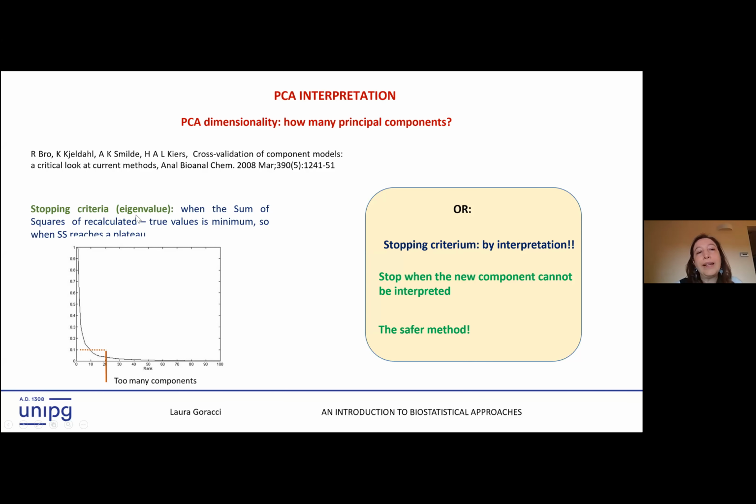Here is the stopping criteria by eigenvalue, which I'm not covering today due to the time, but the best criteria, especially if you're not an expert, would be stopping by interpretation. When you are not able to interpret your data anymore, it's better to stop.